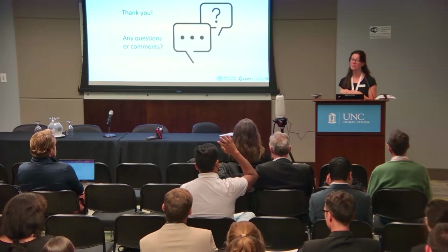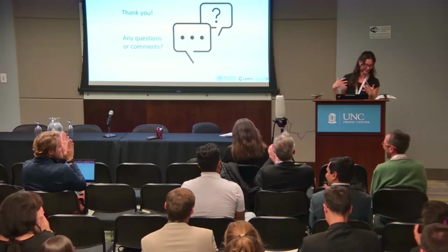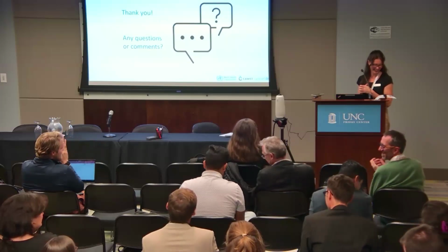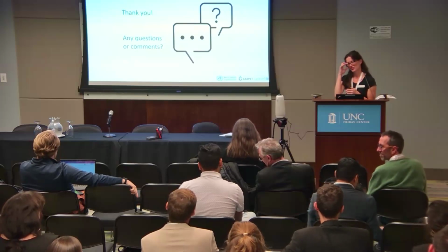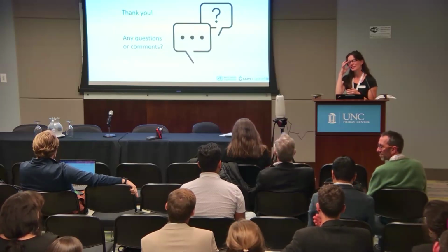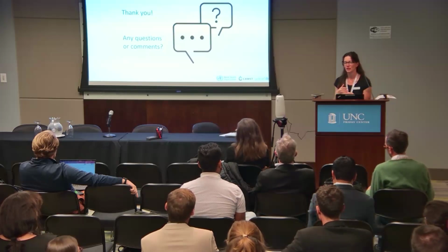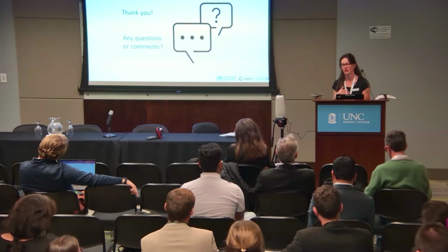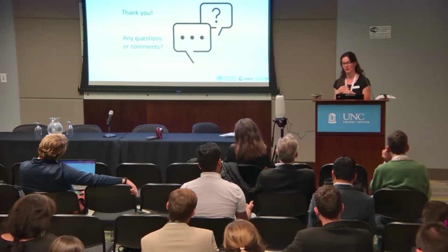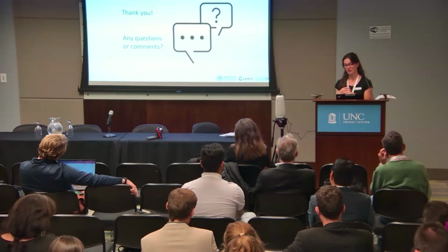Anybody wants one? Yeah. So I saw the parameters to verify the chemical contaminants. I noticed there's no PFAS in there, given that the maximum contamination limit for PFAS is at least 1,000 times less than the ones you have mentioned in there. Given the increased concern of PFAS around the globe, I was wondering why it was not there.